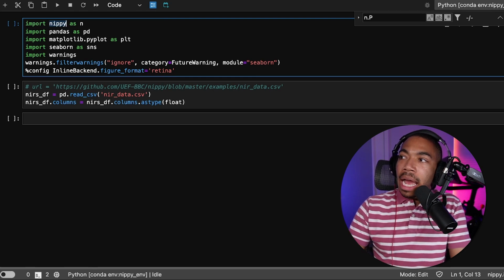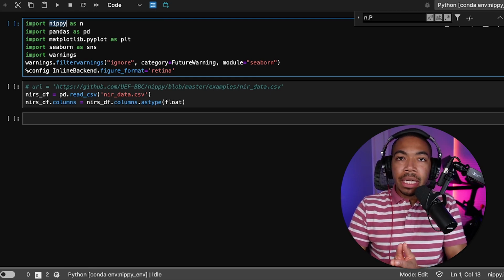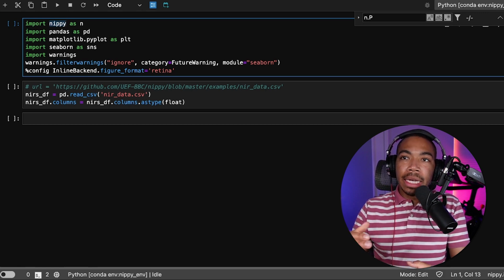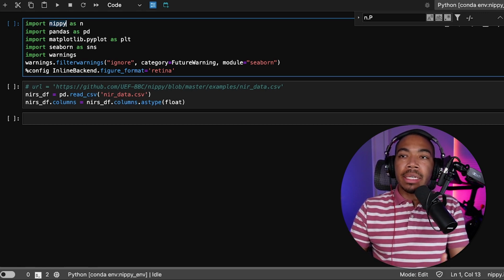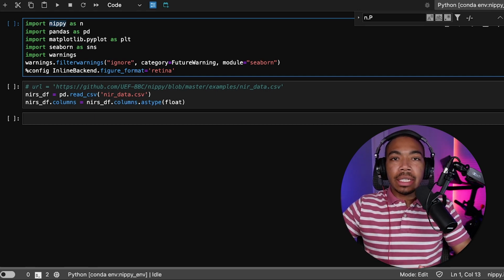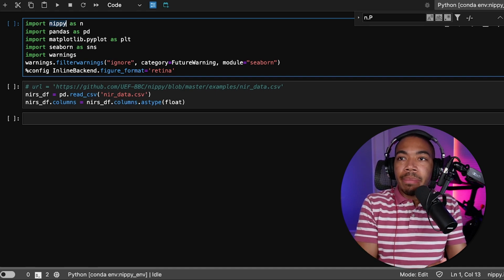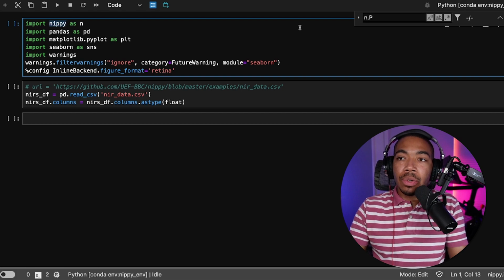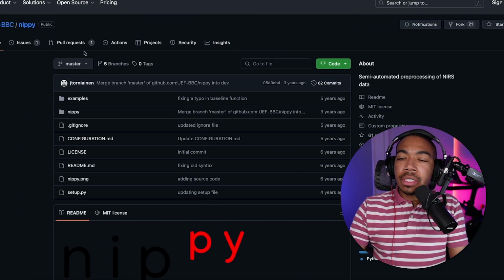And so I have created a NIPPY environment. I duplicated my base environment and added NIPPY to my Jupyter, Pandas, Plotly, my normal data science environment. Just in case something else goes wrong or I need to update some libraries, I don't impact my base library. So ensure you do that, especially when exploring new libraries that are very different.